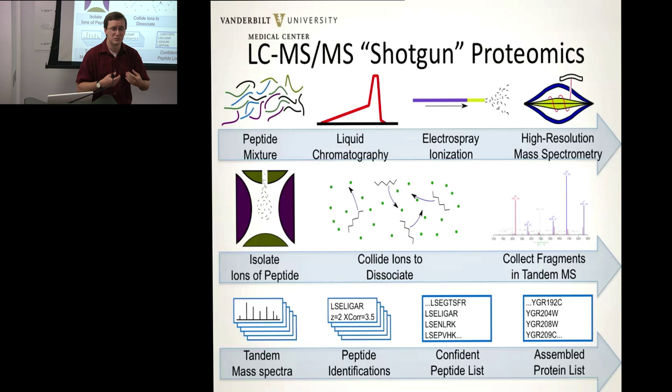So that breakage is starting with a uniform collection of homogeneous ions, basically. They're all ions of the same mass to charge. They're ostensibly the same peptide. By undergoing CID, we're producing fragments from those. And some of them are going to break in different places, so we're going to have a heterogeneous collection of fragments in the trap. But they all reflect one type of peptide, generally.